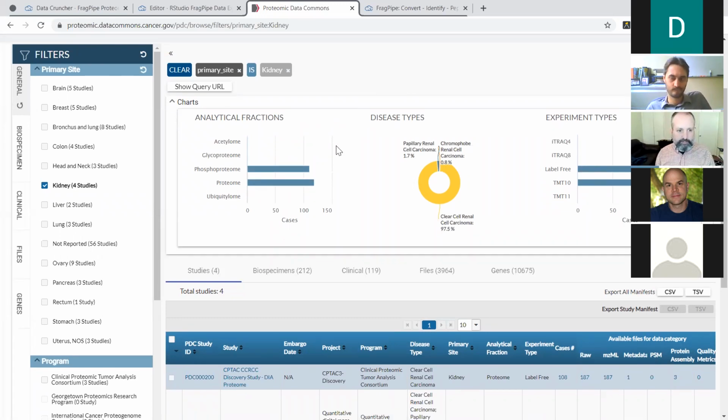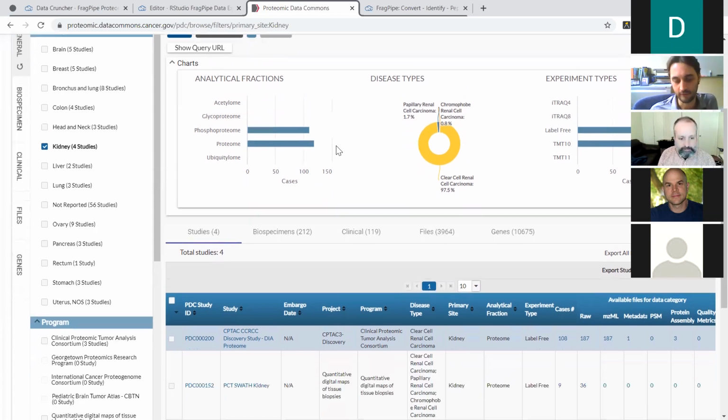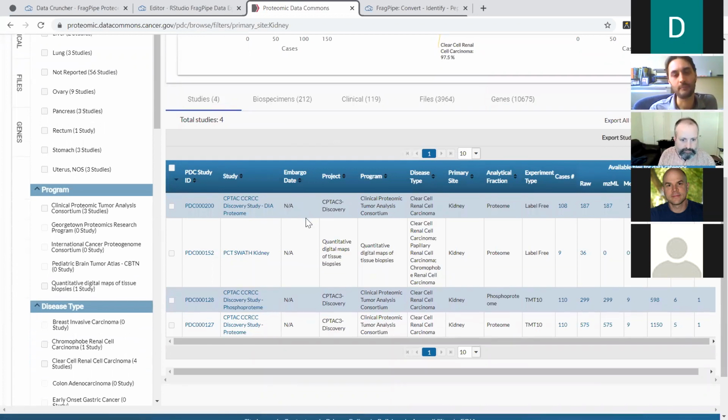The parameters would be different, right? Is what Felipe said. If we use a different cancer type, the parameters would be different as well. Is that true? So first step, reach out to Felipe and do what he says, not what I say. It depends. I processed several of the CPTAC 3 cohorts so far, and most of them share the same parameters. But for some other cohorts, you need to make some adjustments.